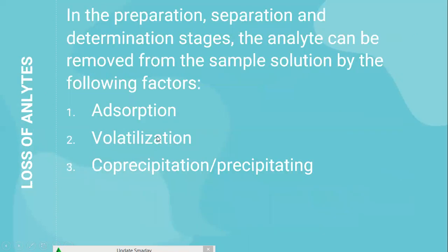Loss of analytes. In the preparation, separation, and determination stage, the analyte can be removed from the sample solution by the following factors: adsorption, volatilization, and co-precipitation or precipitation.